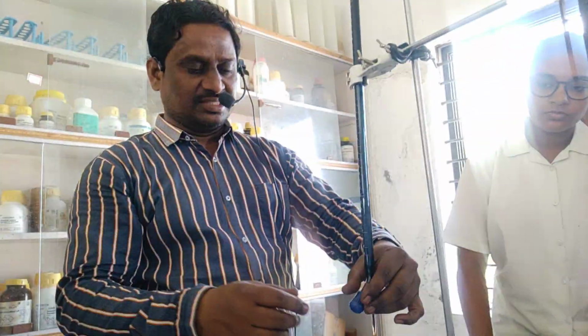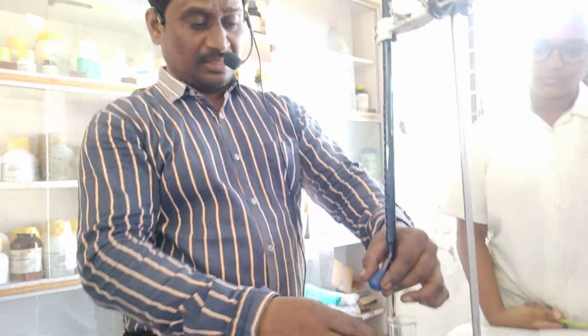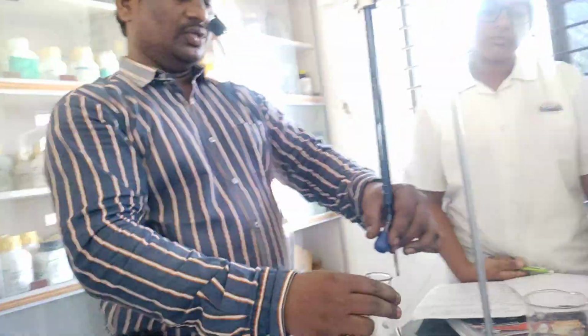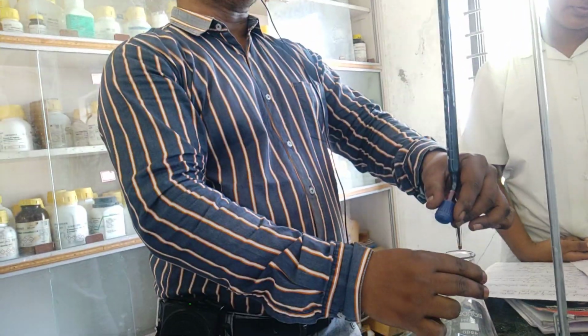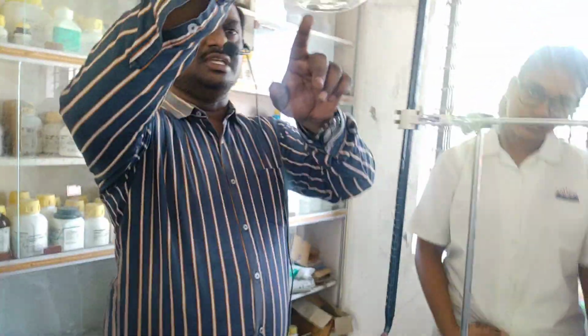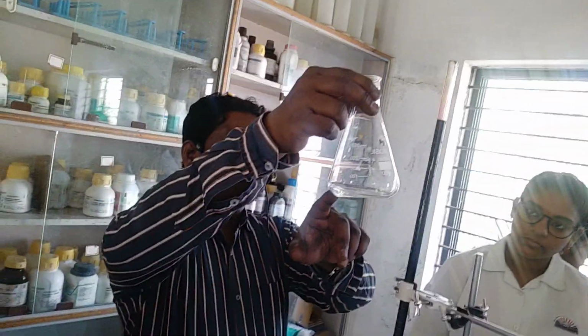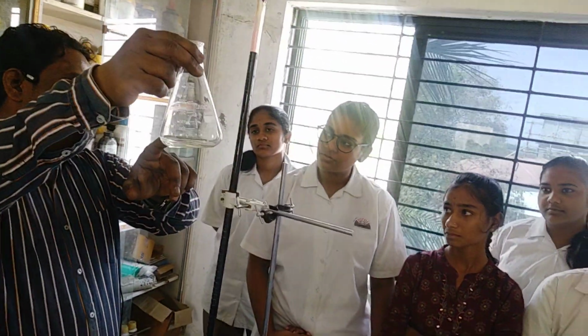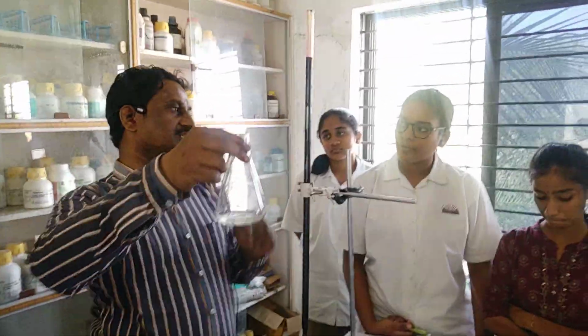And one more thing, while operating this burette, see carefully these three fingers, along with this thumb, should be on the stopcock. And our conical flask should be in the right hand. You have to release drop wise, one drop at a time. See, first of all, this is colorless. This colorless will change into pale pink. Up to then you have to perform the experiment.